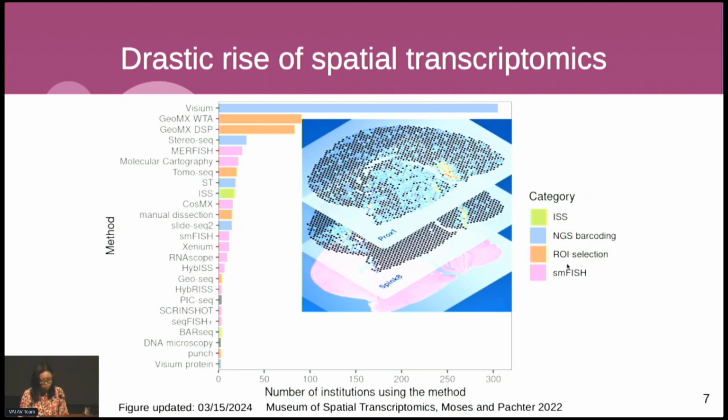There are those based on next generation sequencing, like Visium, already used by over 300, now probably more institutions. How it works is that you have a tissue section, and you can usually stain that with H&E or some sort of fluorescent stain, immunofluorescence, and you mount this tissue section onto a special microscope slide. That slide has a hexagonal array of spots that have barcodes whose spatial locations are known, and it also has a poly-T sequence to capture polyadenylated mRNA molecules in situ from the tissue. From the capture we can sequence the transcripts to quantify their expression at each spot and map that to locations in tissue.